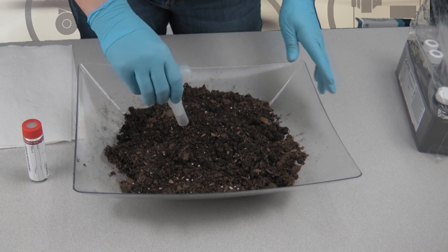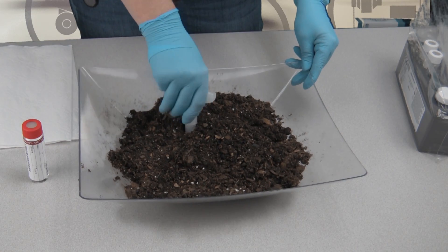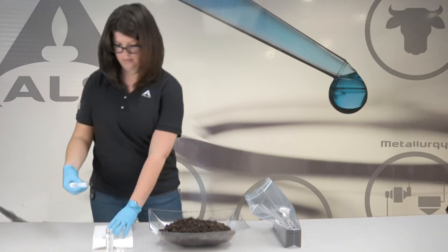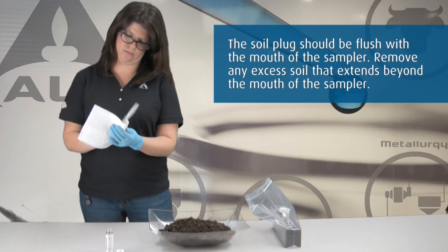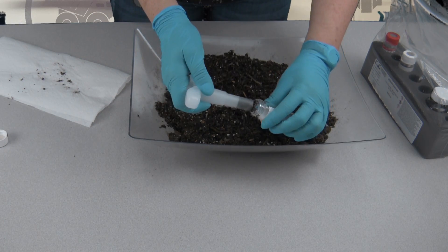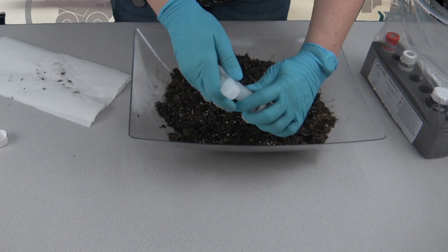With the plunger seated in the handle, push the TerraCore sampler into freshly exposed soil until the sample chamber is filled. Wipe all soil or debris from the outside of the TerraCore sampler. Place the mouth of the sampler into the 40 milliliter VOA vial.